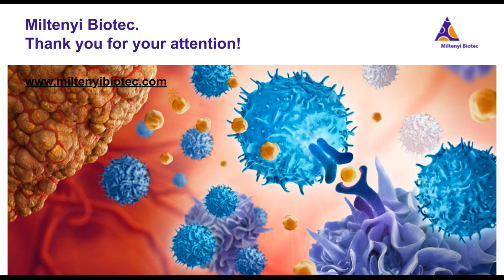Can the SARS-CoV-2 T-cell analysis kits also be used for the analysis of other antigen-specific T cells? Oh yeah, that's also an interesting question. As I said in my presentation, we've also just released a version of the kit that does not include a Peptivator peptide pool. So in this kit version, you could just use your own stimulation control to stimulate, for example, tumor-specific T cells, and then just use the included reagents and the included flow panel to analyze antigen-specific T cells.